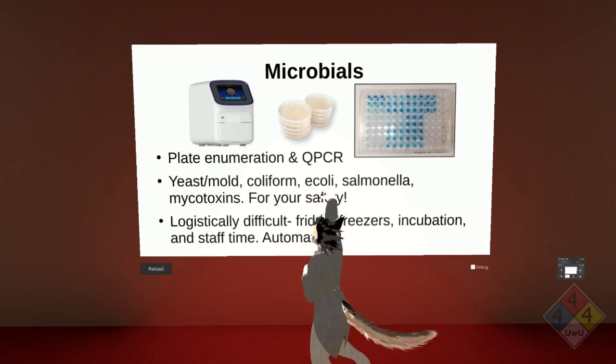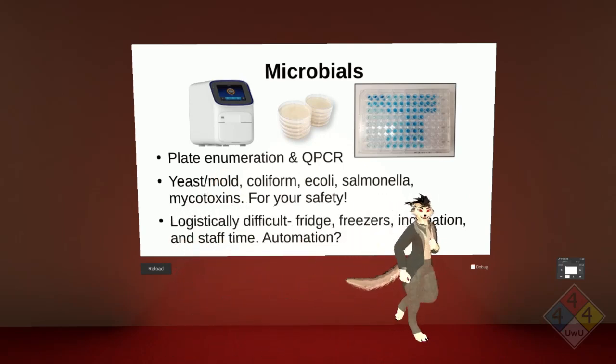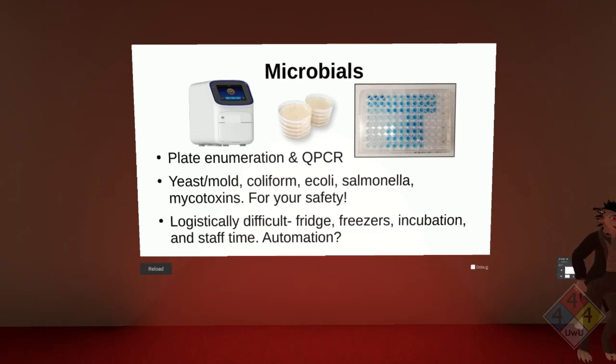The PCR is here. Now, if you know PCR, polymerase chain reaction, that's something you may have learned even in high school, and it's a way of amplifying genetic material, so you have more genetic material, because that's the way DNA works. So this is a specialized instrument that does the amplification for you, and using some assumptions, it's able to do quantification, because if you can make assumptions about initial states of genetic material and its amplification rate, and if you can measure it accurately from beginning to end, then you can get some pretty reasonable quantification assumptions.